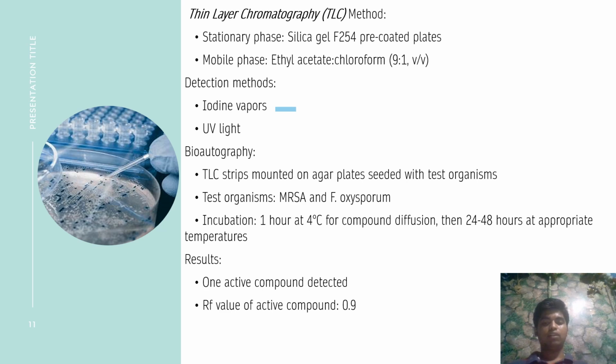The result obtained was that one active compound was detected, and the Rf value of the active compound was 0.9. Rf, the retention factor, is equal to the distance traveled by the compound divided by the distance traveled by the solvent.